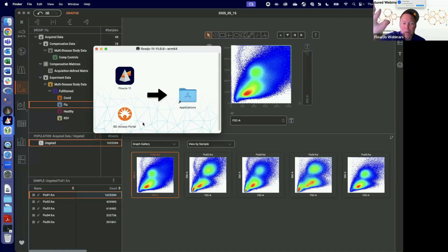When I opened it up, it pops up with a little side panel that just assigns it to the Access portal, but it is a separate program that you have to have running. And it is Mac and Windows, and it looks identical in the two. I work continuously on Mac and Windows.